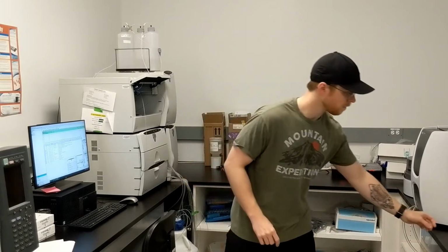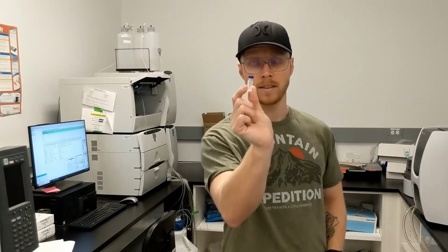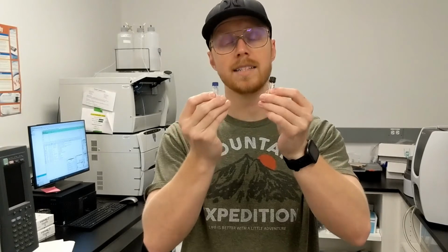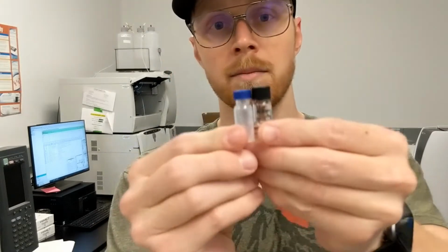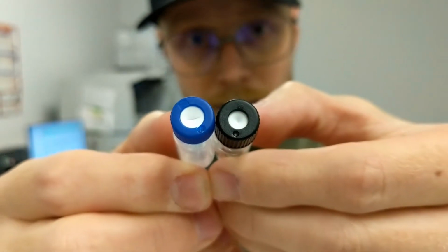Once your samples are prepared, you need to put them in the correct vials. The correct vial is this small blue vial. It has a little blue cap and a plastic body to it. You might think that these HPLC vials are fine because they're almost the same size, but there's actually an important difference. They are slightly different heights, and the holes in the top are slightly different size. This makes a huge difference for the autosampler.